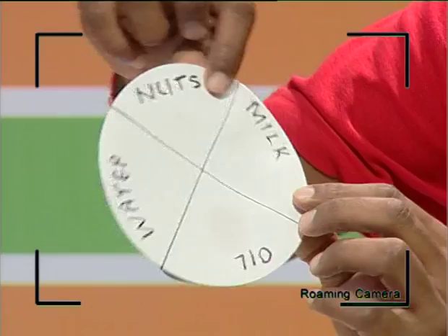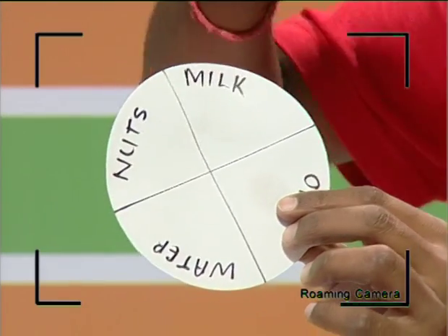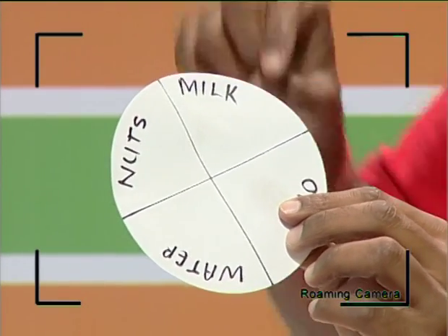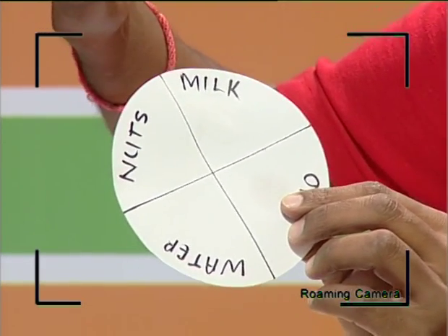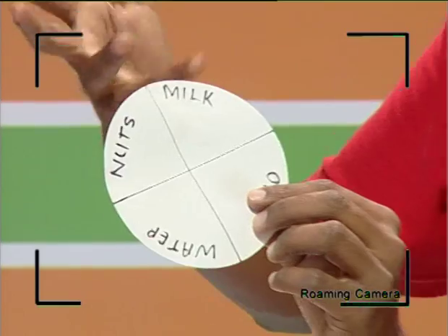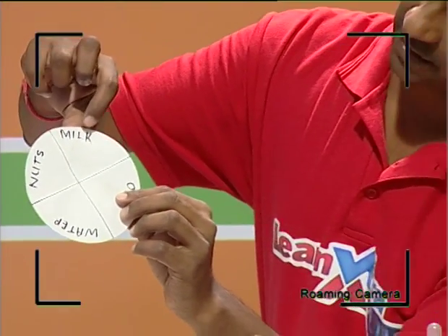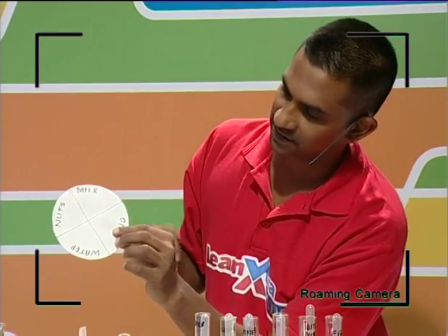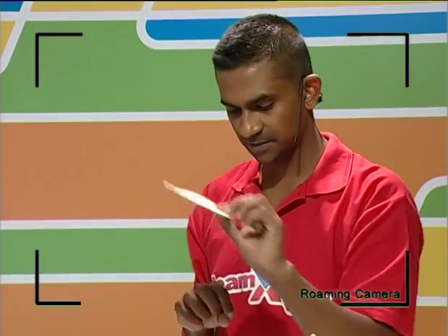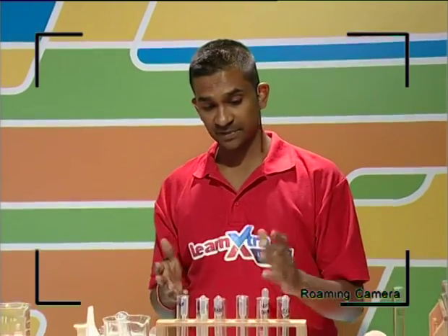of oils. In milk, guys, remember that the cream in milk is obviously a bit of fat, so you get low fat milk, you get 2% fat, and you get 0% fat. So here is a sample of milk, and obviously that contained fat, and you can clearly see the stain, the emulsion on this here. So we've worked on the lipid test, and we've looked at the presence of lipid.